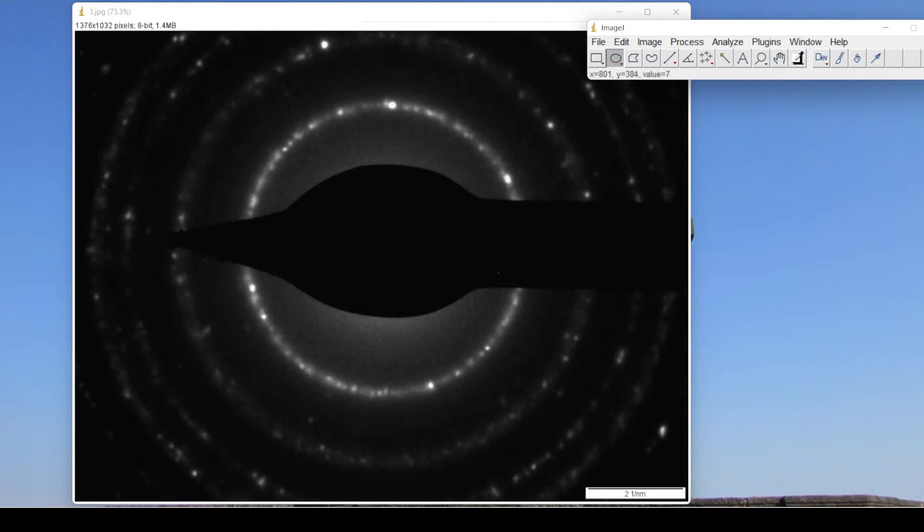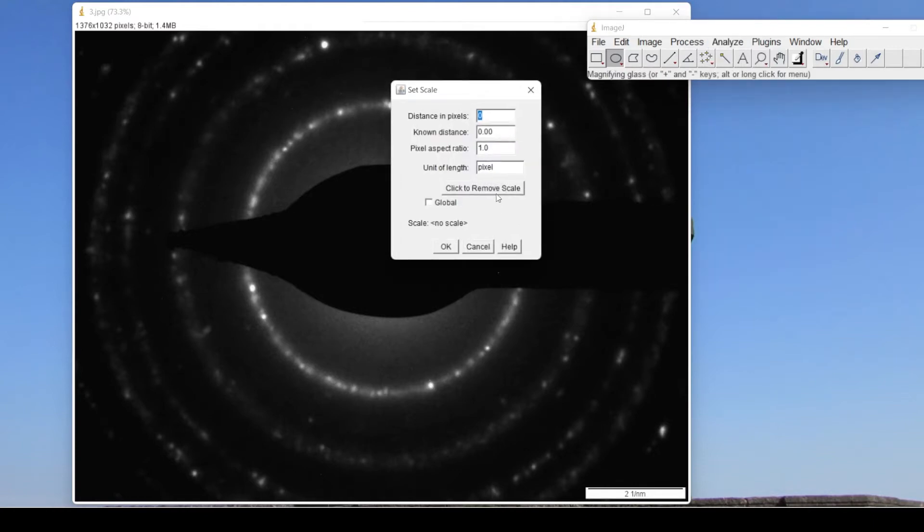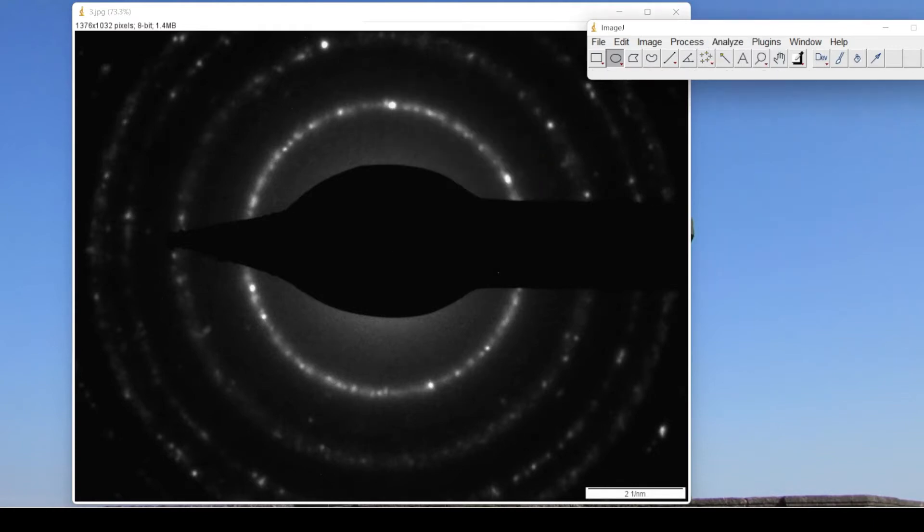So for this, first we have to set the scale. For that, go to Analysis, Set Scale, click to remove scale. That's okay.